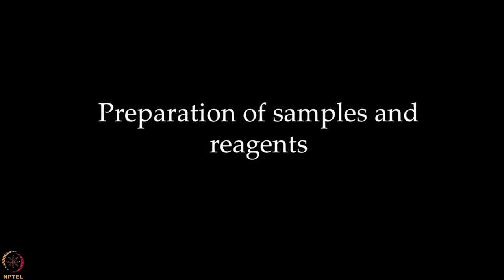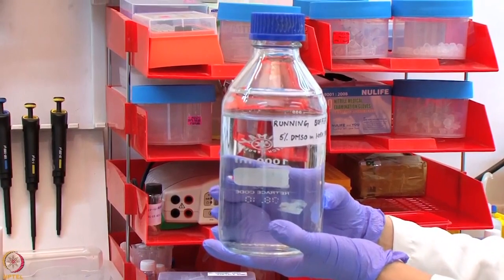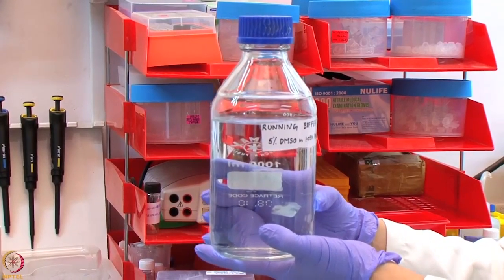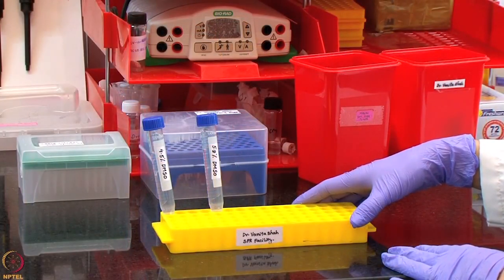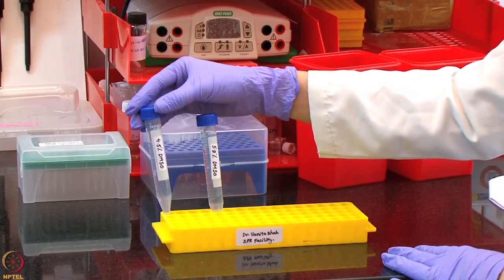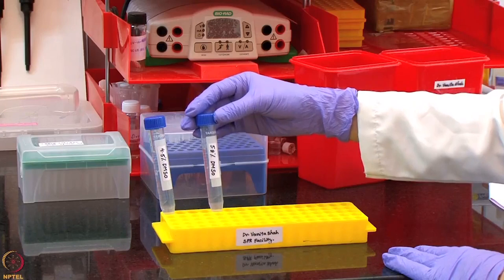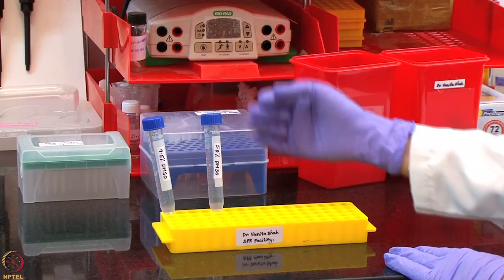We will now work on the reagents required for the screening assay for binding of proteins, human serum albumin and carbonic anhydrase, against several small drug molecules. In this protein small molecule study, we will be using 5% DMSO in 1.05x PBS as the running buffer, which will also be used for the initial startup cycles. 8 different solvent correction solutions will be prepared, ranging from 4.5% DMSO in PBS to 5.8% DMSO in PBS, and these solutions will be prepared by mixing in different ratios as shown here.